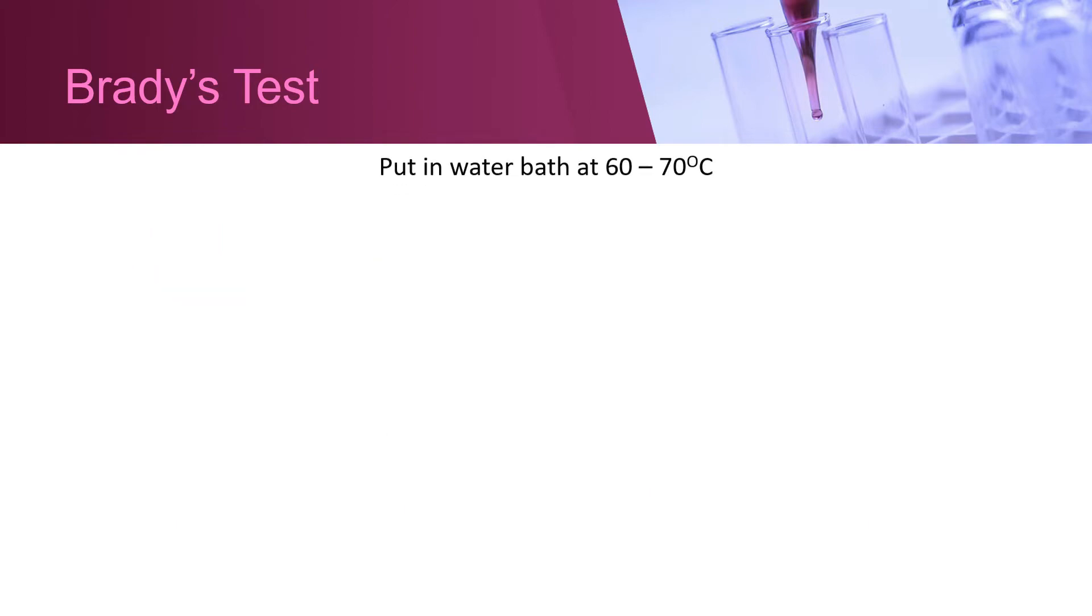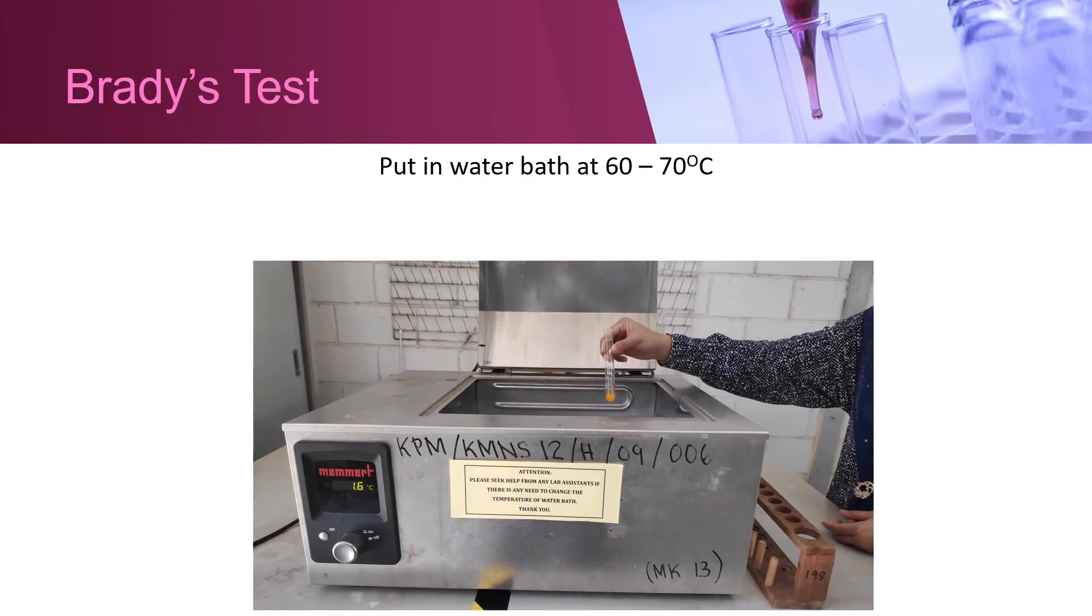Shake the test tube and heat in a water bath at 60 to 70 degrees Celsius. Observe the formation of precipitate.